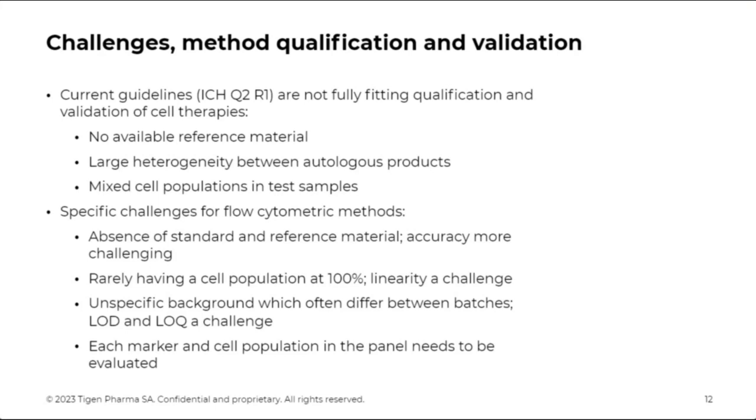And the linearity is a challenge because we rarely have a cell population of 100%. And many times there is an unspecific background, which also may differ between different batches. So it's a challenge to determine the limit of detection, the LOD, and the limit of quantification, which is LOQ. And we have also that it's extensive work that needs to be done because each marker and each cell population in the panel needs to be evaluated.